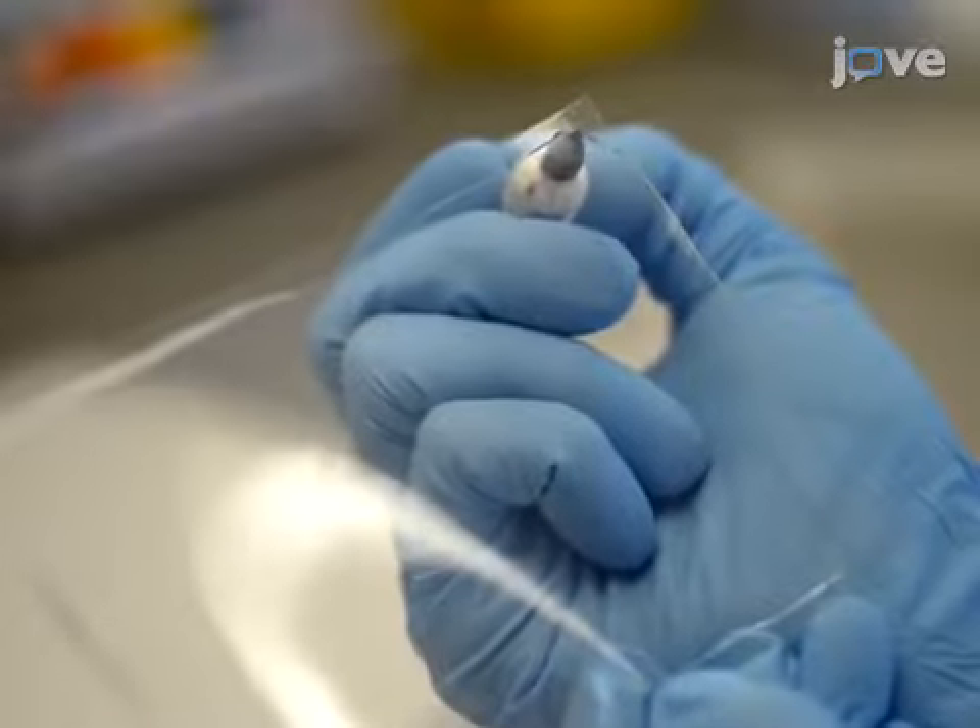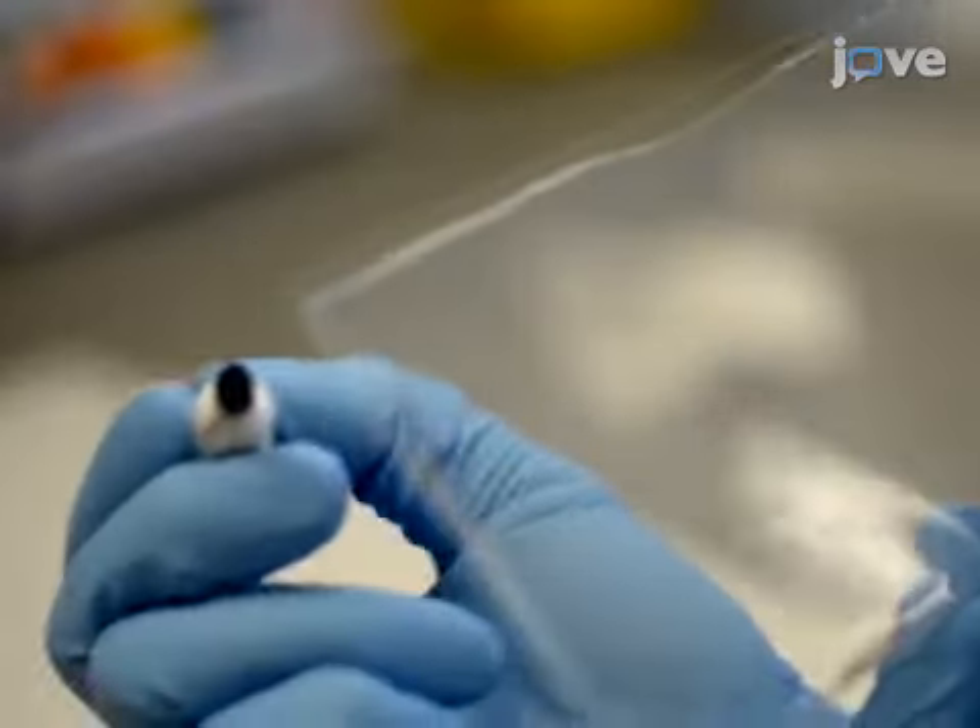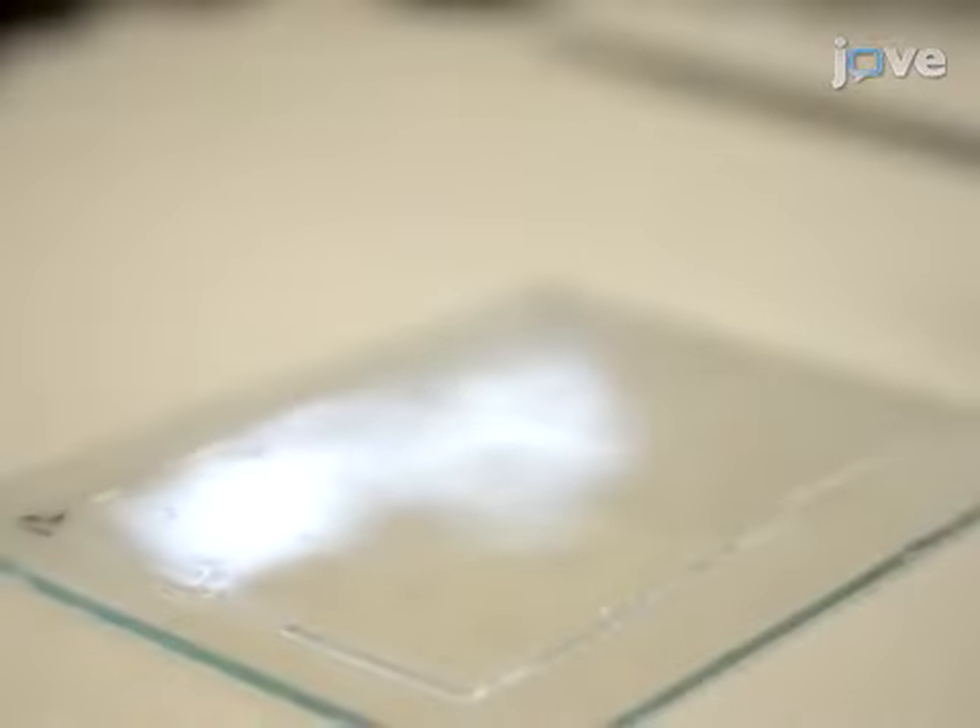Then label the orientation of the gel accordingly. Now, gently press an inverted bottomless 96-well plate.